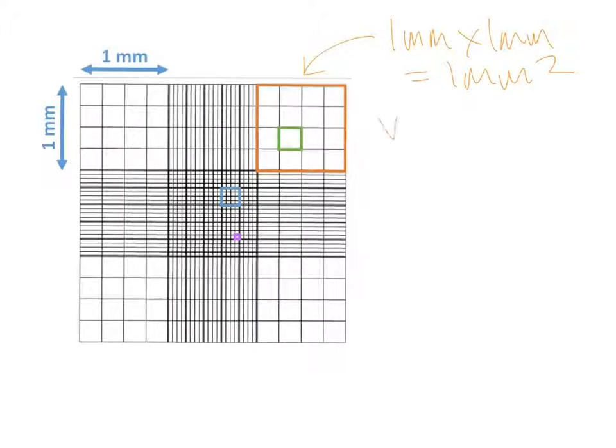Now, in terms of the volume, what we need to know is that the depth is defined by the cover slip, which is resting 0.1 millimeters above the haemocytometer. So that's the depth of our system.